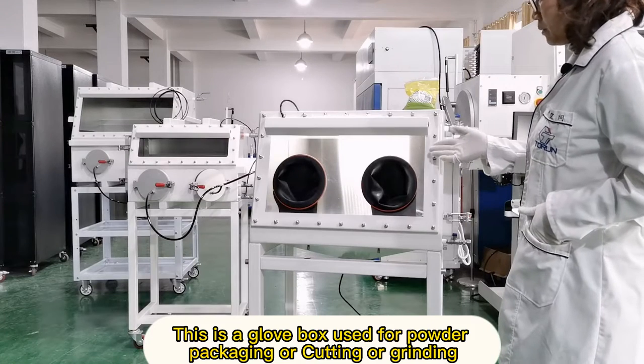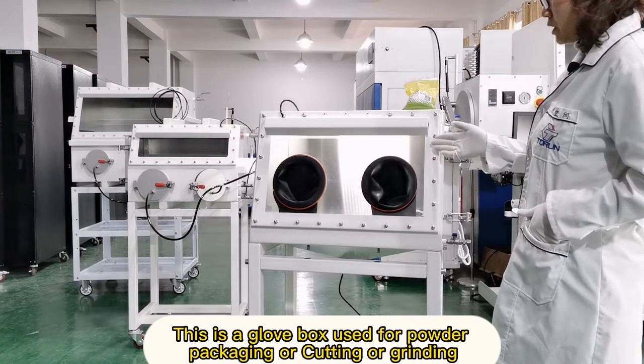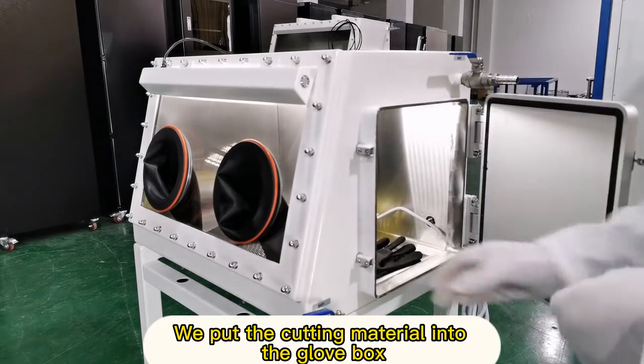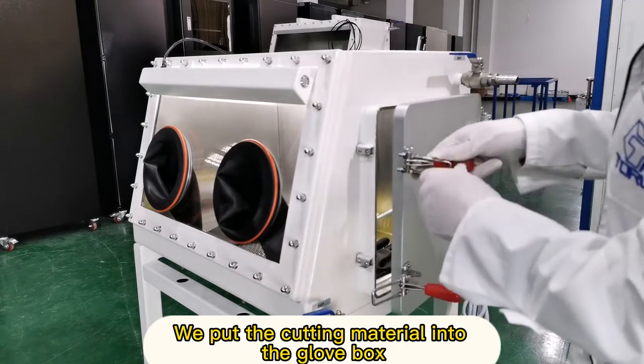Hello, welcome to Torrent. This is a glove box used for powder packaging, cutting, or grinding. This client is making cutting material. We put the cutting material into the glove box.